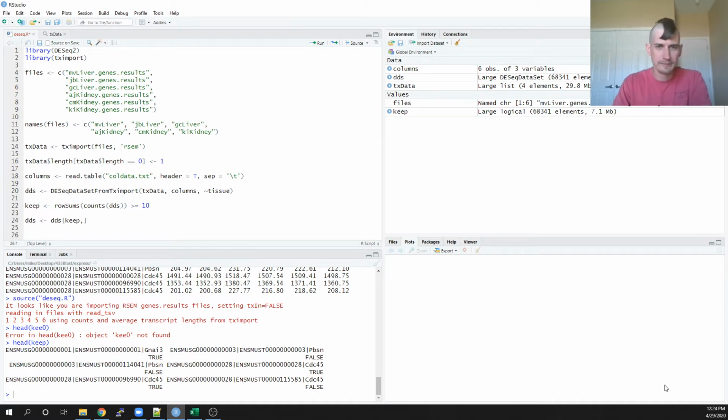All right. What else? Okay. So the first thing that I do want to hang on to, I need to find a couple of lines. Give me a second. I need to find these 3 lines.